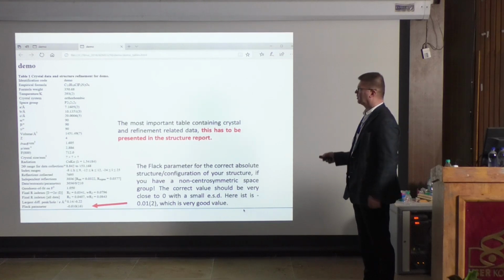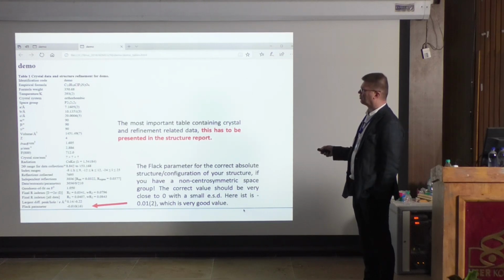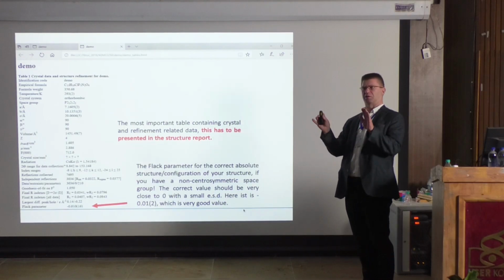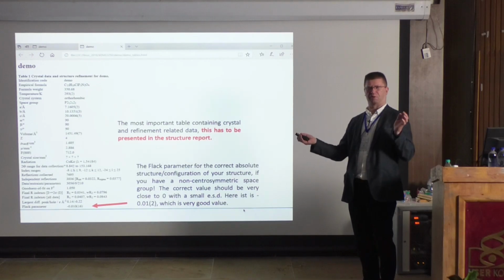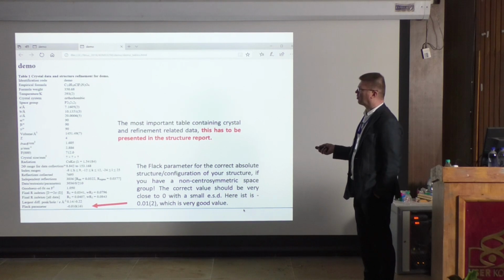In this case, we are very lucky because there are chlorine and fluorine atoms, where the separation of this 0 0 2 and 0 0 -2 is big. And the heavier the atoms we have, the bigger the differences are.